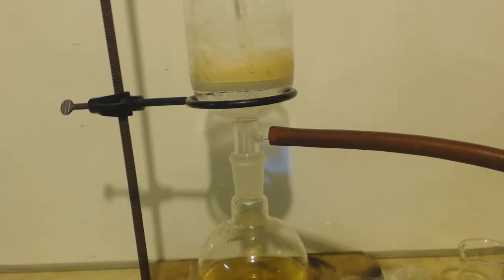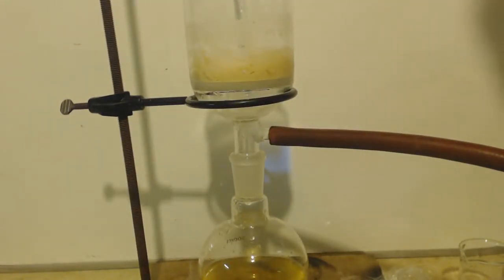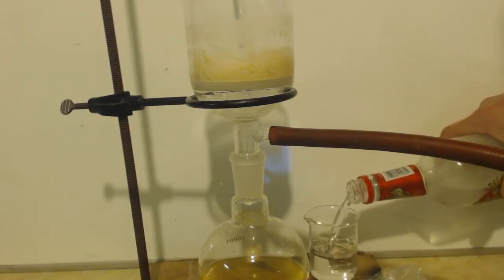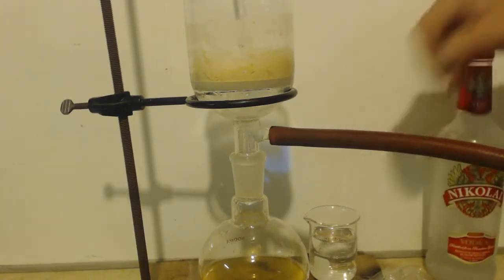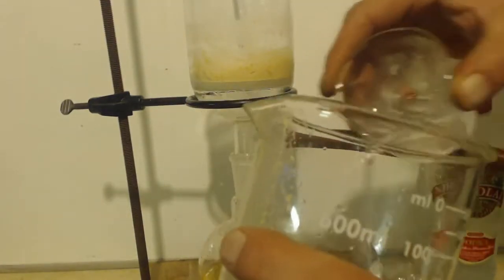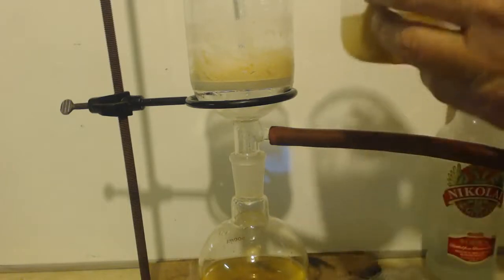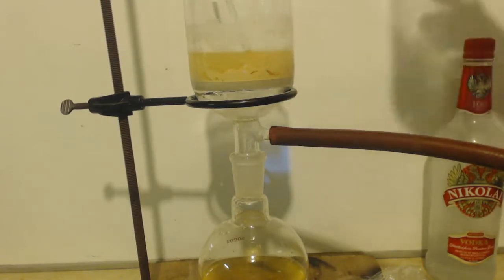There's your stuff. I still got this. All right, I got 100 proof vodka here. I mean, yeah, 100 proof, that's 50% by volume. I'm going to get about 100 milliliters. What do I got there? Like 96, 97 milliliters. I'm going to toss it in this crap stuff, and then I'm going to pour it on here to wash it. Nice one.